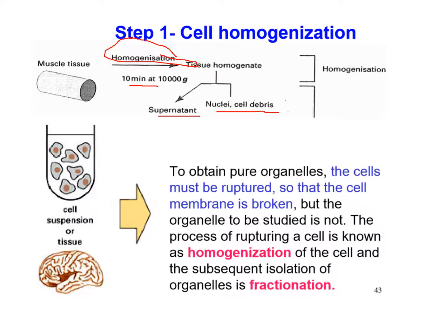The nucleus can be set aside for nuclear study. Or if you're interested in Golgi, mitochondria, a virus, a bacteria, that's all going to be here. So you're just prepping this tissue to individual cells and then dividing into the cytosol, the supernate, and the nucleus.